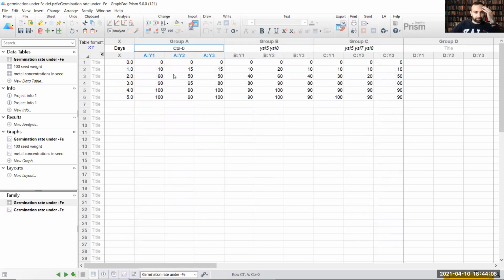So here, for example, we can make a germination curve. So in the x-axis, we can say days, and then first day, second, third, fourth. And this is the percent germinated plants. So in the first replicate, these are the replications. So we have 3 replications.